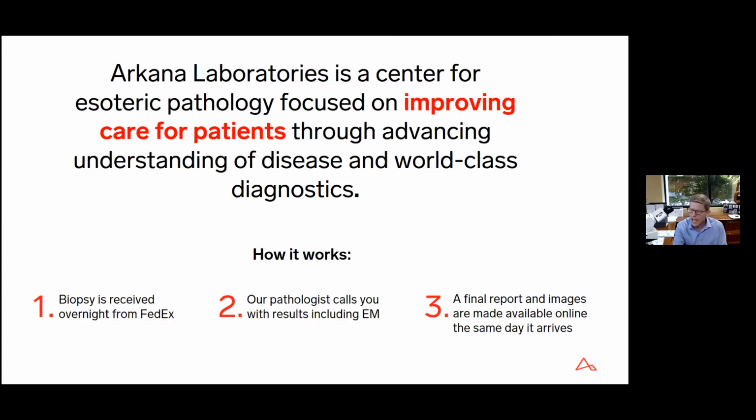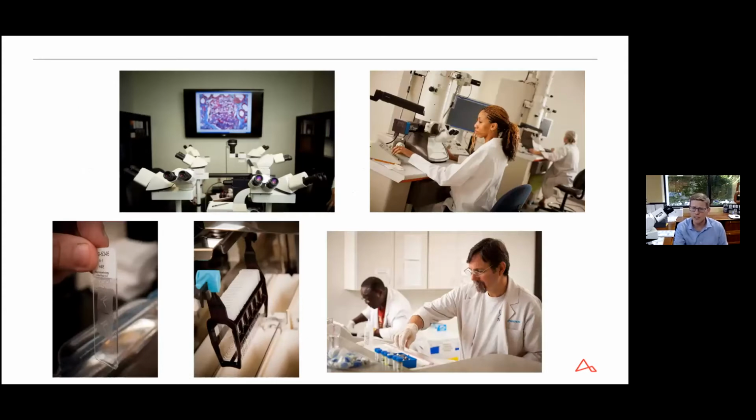So I could show a lot of pictures and describe what happens in a laboratory, but we've got you here, and today it's just as easy, if not better, to actually take you into the laboratory. I think you're going to gain a lot more understanding if we just show you what happens in the laboratory. So now I'm going to turn this over to my friend Denise, who's down the hall here at Arkana in the laboratory, and she's going to walk you through how a renal biopsy is processed in the laboratory.